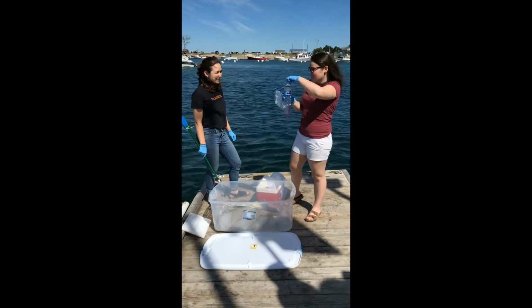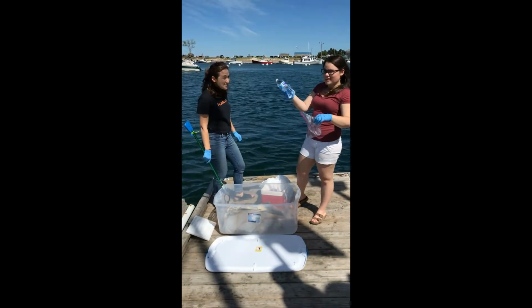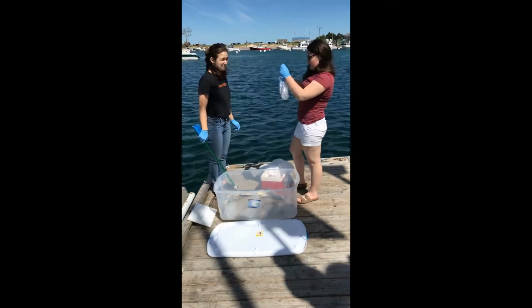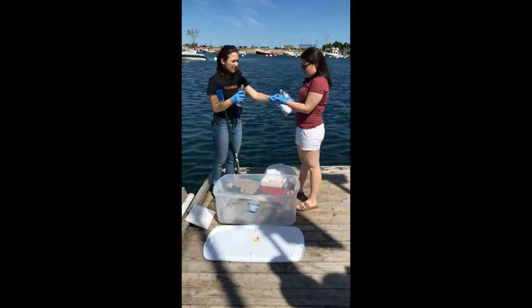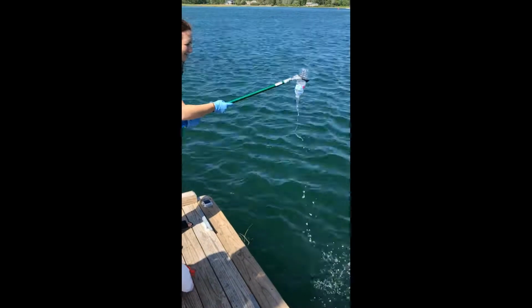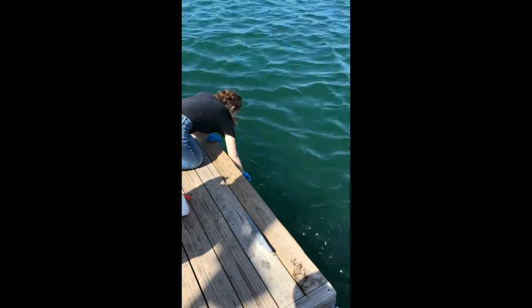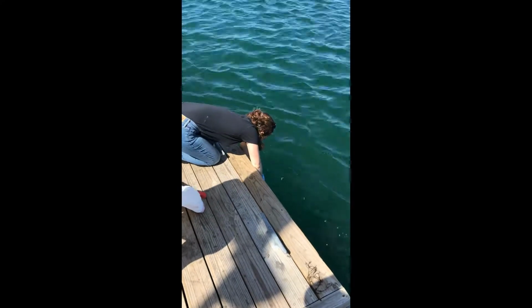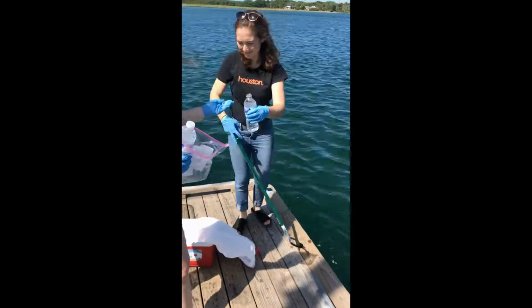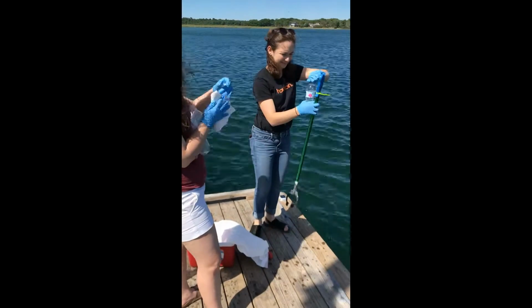I'm going to submerge it using a grabber tool that you see in my hand, putting it down 1 meter to get water from there. And that's the same depth that we put our tow net later on. So it's pretty cool. We take that water back to the lab at UNH and extract the DNA, and fingers crossed, what we find is the same species that Michelle can taxonomically ID in the lab.